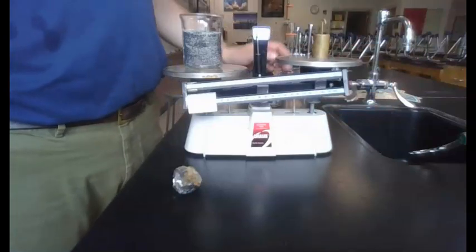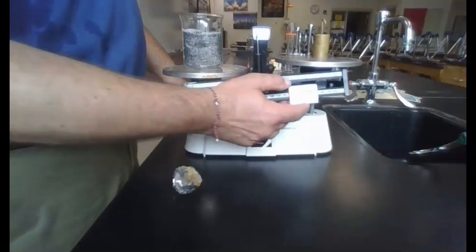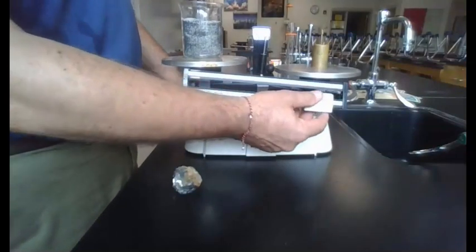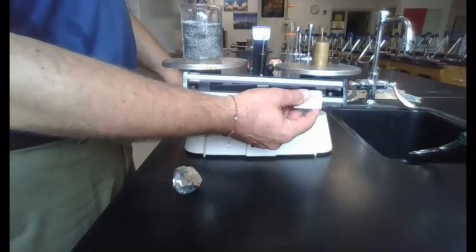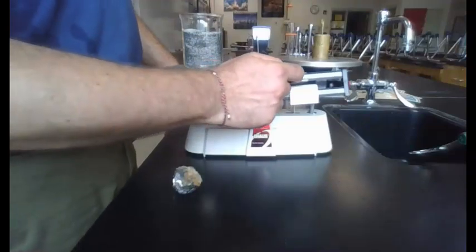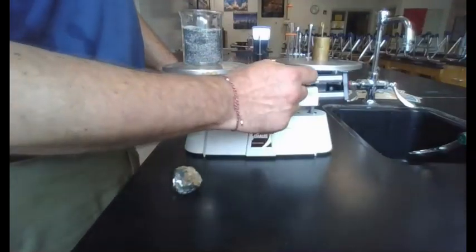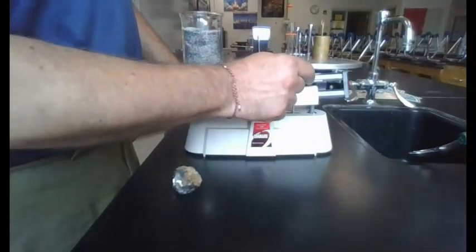I'm going to put 200 grams here. And then, as I go up to, whoop, 1 too many, still too many, 1 too many, slide that forward. A little more, we got to get that 0 on the line.